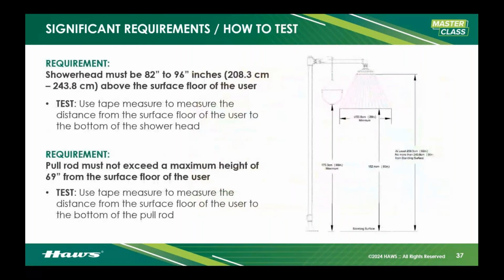The other thing you need to consider is that the shower head has to be 82 to 96 inches above the surface floor of the user. Okay. Now, if it is under 82 inches, the flow pattern is going to be too narrow. It's not going to completely cover our body, and maybe a more intense spray on the user itself. If it is above 96 inches, this I see very frequently in hospitals as they install their shower heads directly into the ceiling tiles, and sometimes those are much too tall. So 82 to 96 inches, that's kind of the golden area in there.